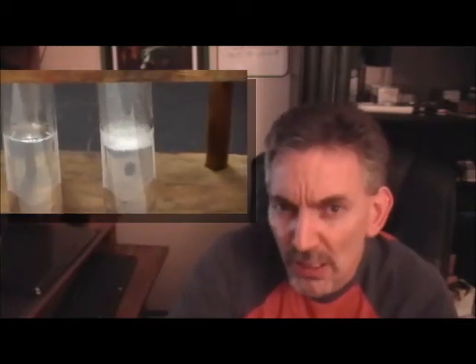Now for these 3 chemicals, the zinc plate, granules and the mossy zinc, you won't be timing the reaction till it finishes. You'll just be visually observing the rate of bubbling as the hydrogen is produced. And you'll assess how fast the reaction is, and therefore how great the surface area to volume ratio is, based on how rapid the bubbling is. As the bubbling becomes more rapid, we have a faster rate of reaction. So it's only going to take about 10 seconds for each sample to work out the comparative rate.